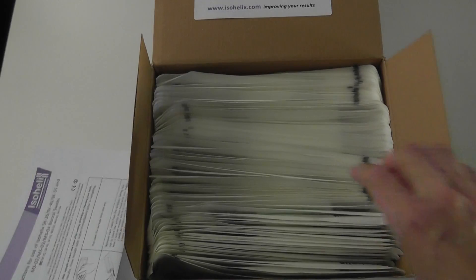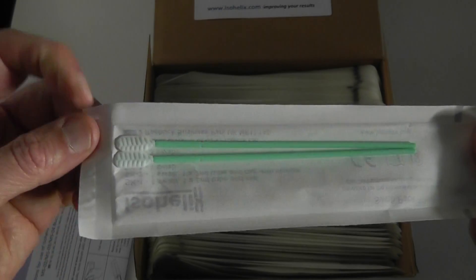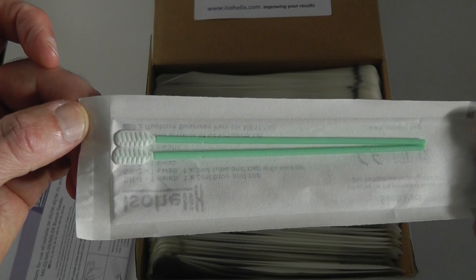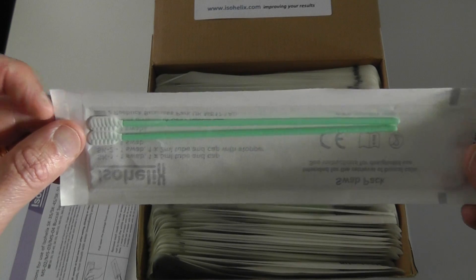Instructions for use are included, and there are the swabs. The swab head is specially designed to optimize DNA collection.